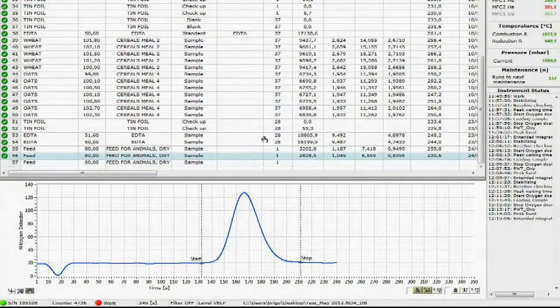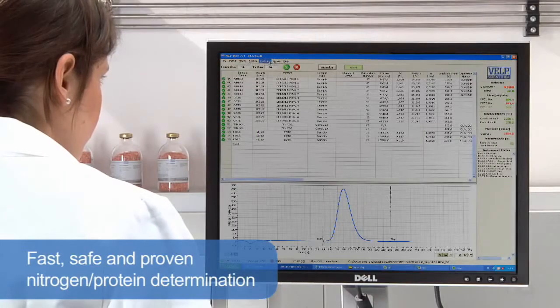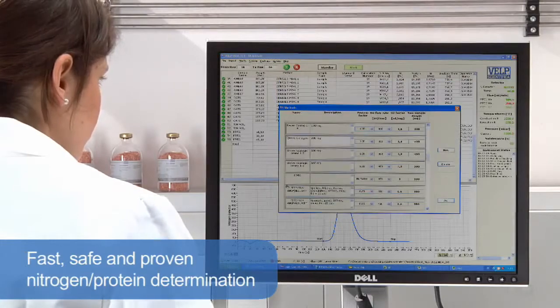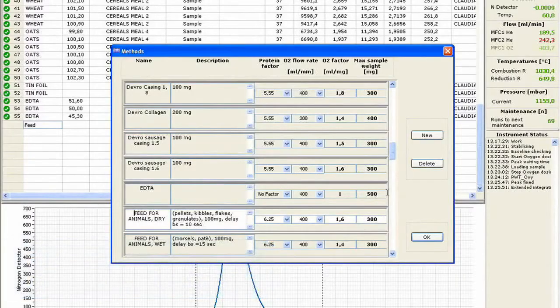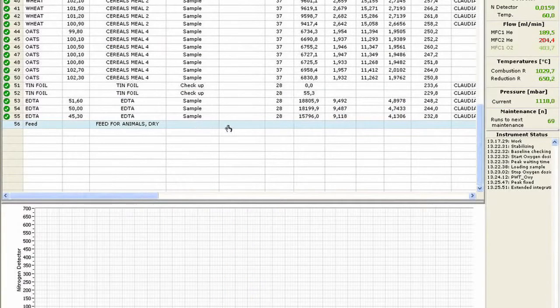The NDA701 has no requirement for hazardous chemicals, providing fast, safe, and proven nitrogen and protein determination. The fully automated NDA701 is entirely controlled via PC through the intuitive Dumasoft software.